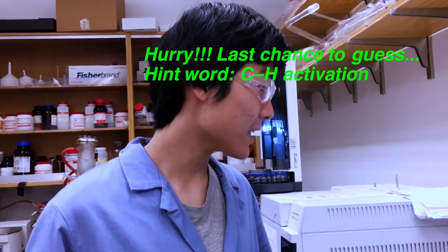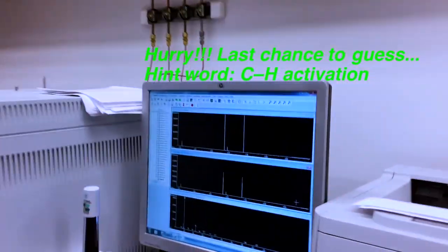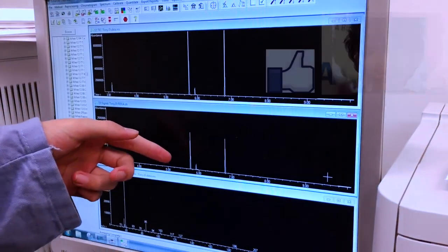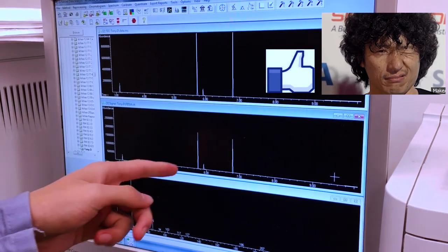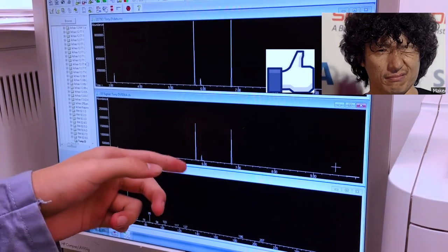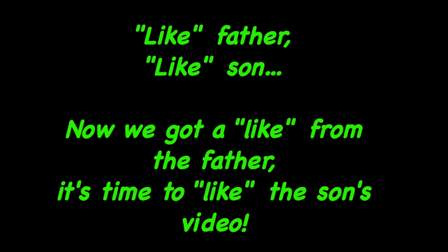Now I'm going to show you how clean the reaction is on the GC. Over here we have the Bpin, and here we have the NHPI, and then this is our desired product here. As you can see, it's pretty clean.